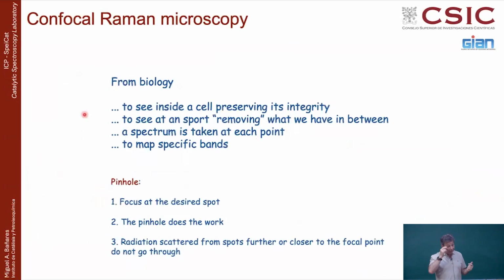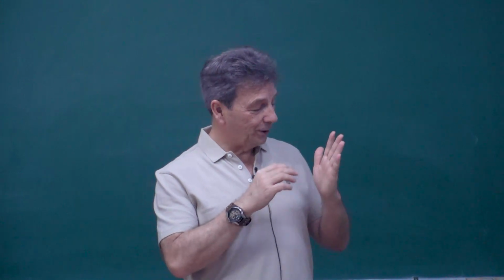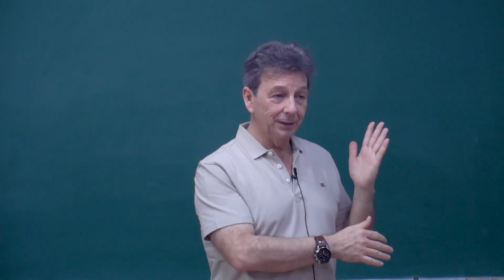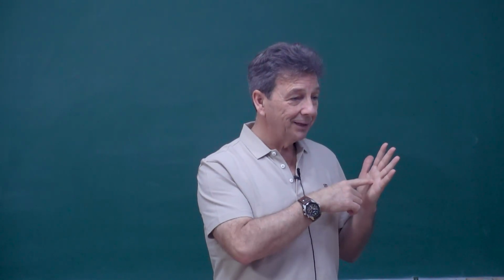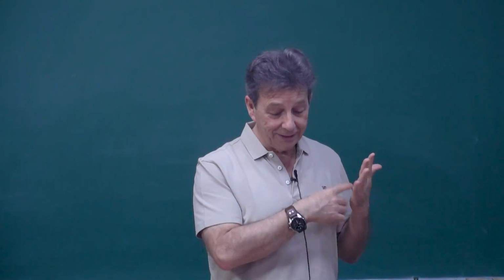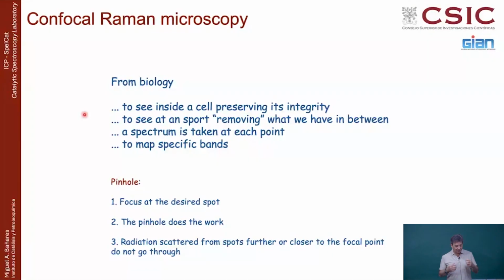Okay, confocal is something which looks like magic to some extent, because it's the ability to look inside a sample without cutting off the outer layers. Basically you see inside, through it, and you can focus inside it. Is it doable? Yes. It's an optical trick. There is a technology to do that. It looks like magic, but it's real.